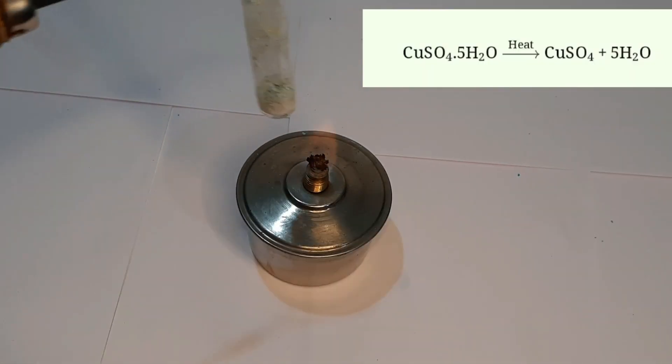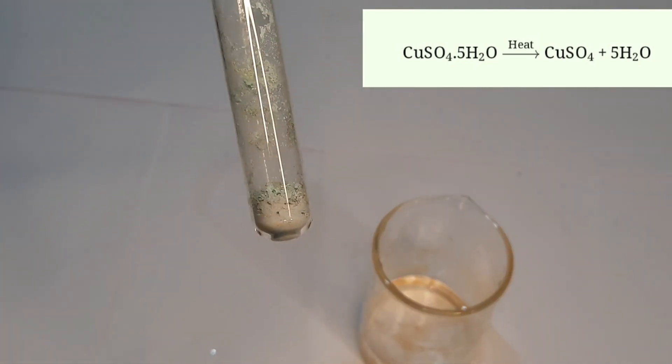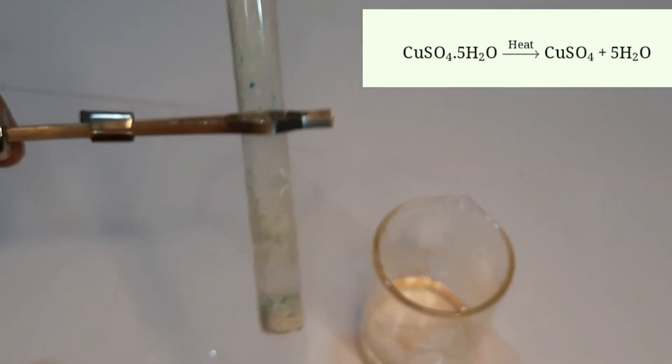When copper sulfate crystals are heated strongly, they lose all the water of crystallization and form anhydrous copper sulfate which is white in color.